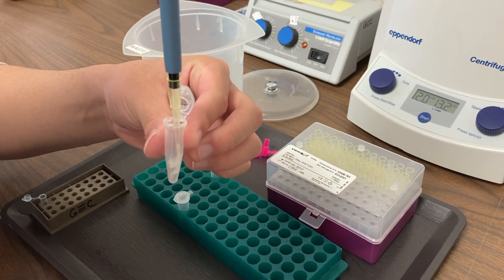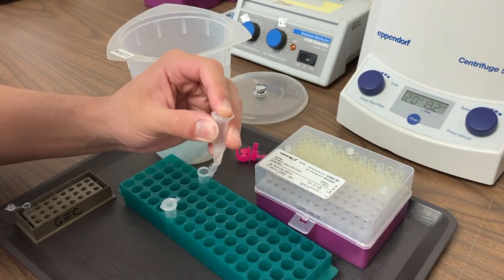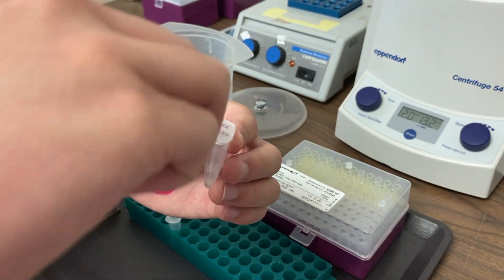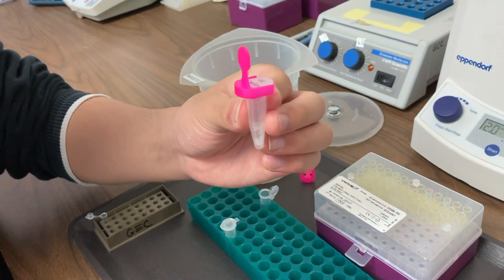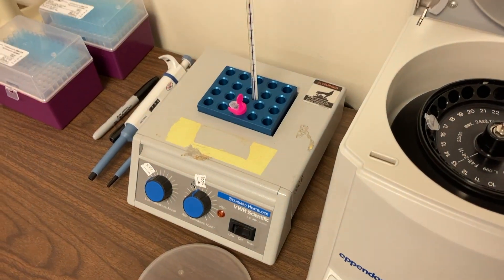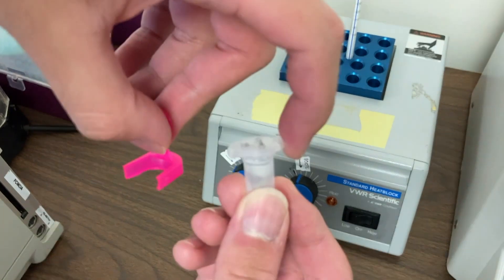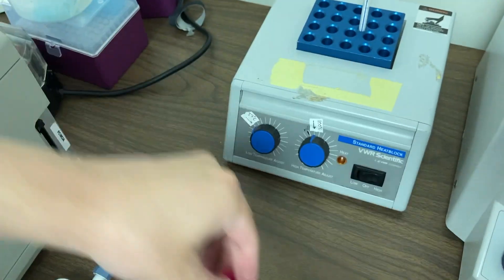We're not going to talk too much about what Kelex is, but it's going to help us separate our DNA from proteins and other parts of the cell that we're less interested in for this lab. We're going to add a cap lock to the top of our tube and put it in a heat block set at 99 or 100 degrees Celsius — that's boiling. Think about what's going on to that cell membrane at 100 degrees Celsius when it's boiling.